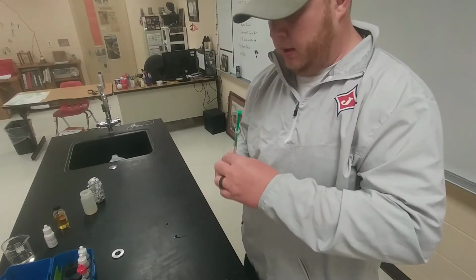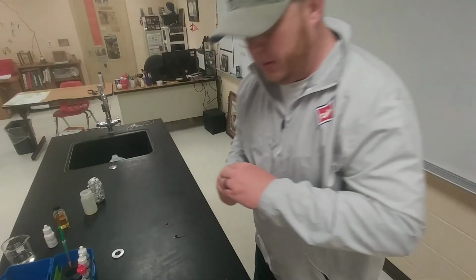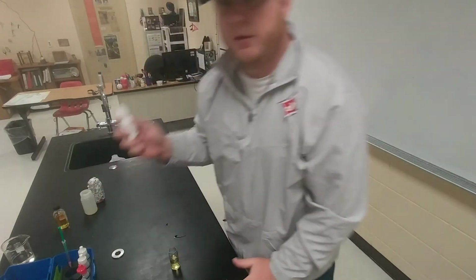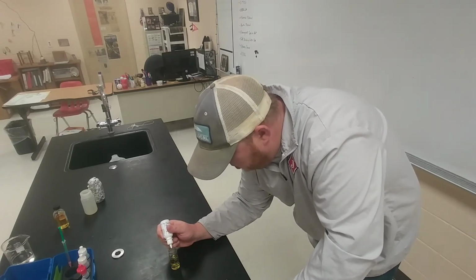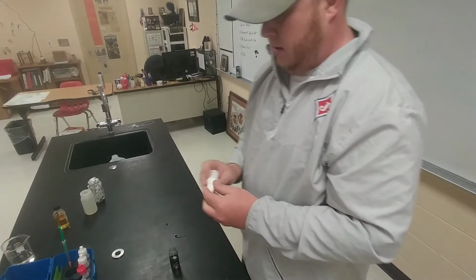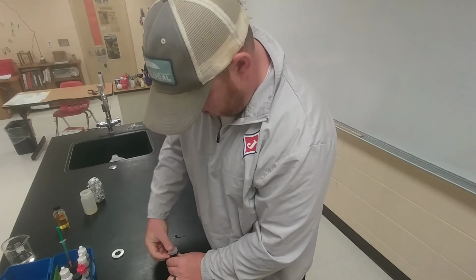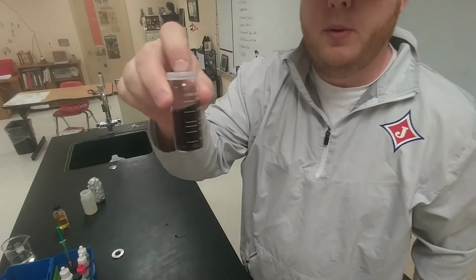The next thing to do is put 8 drops of the starch indicator in here to turn this sample blue. I'm pretty sure it's 8 drops. So here's the starch indicator, and we'll just go 1, 2, 3, 4, 5, 6, 7, 8. Mix this around a little bit. Let's turn blue.